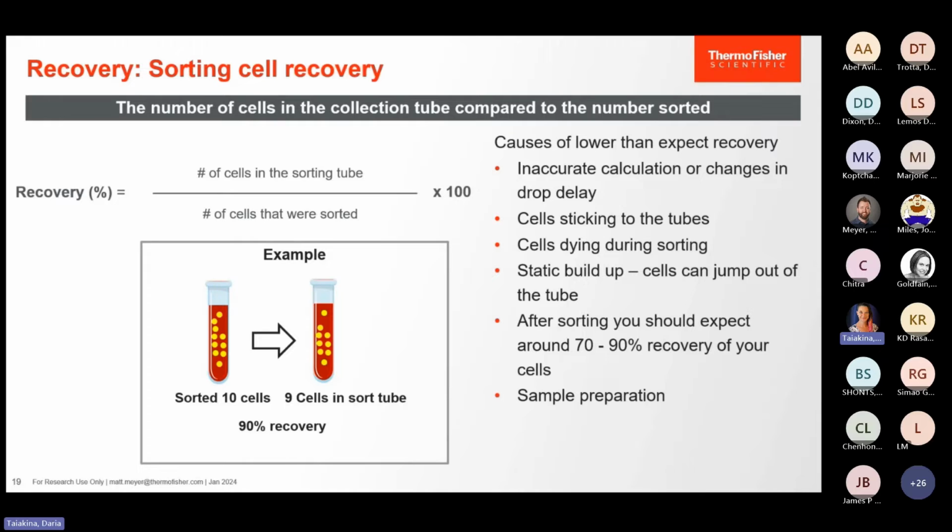If you're using, say, a sample that has low viability, very delicate, fragile cells with a lot of debris, a very tough sort, yeah, you're going to be down in that 70% range. But very good sample preparation can help with that: washing, getting rid of some of the debris, using the appropriate optimization of temperatures, things of that nature, and really good side streams that limit the amount of fanning of the side streams. That can really get you much better recovery.